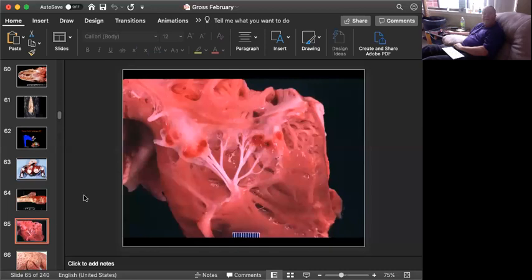Okay, time's up. Looking at one of the cardiac valves here, and you can see these somewhat bloody cysts on the valves, and these are known as hematocysts. Hematocysts are incidental findings. They don't cause any problem, and they're usually a result of a little defect in embryological development of the valve. What happens is that as the valve develops, you have small vessels in there that supply blood to the developing valve.